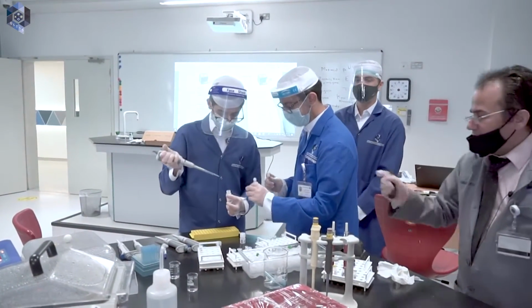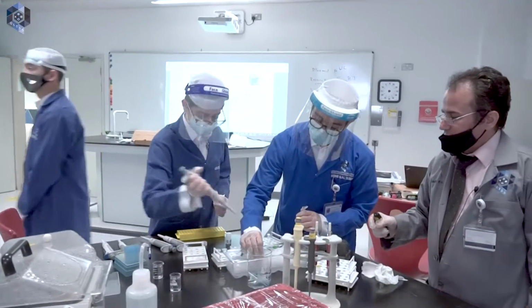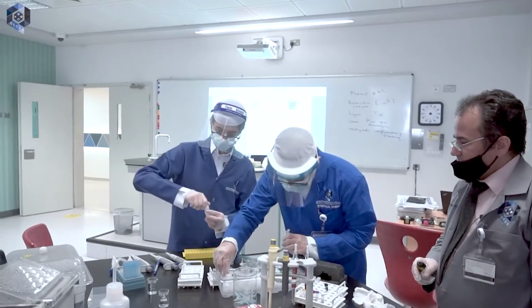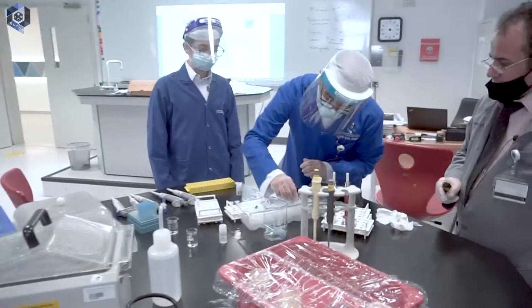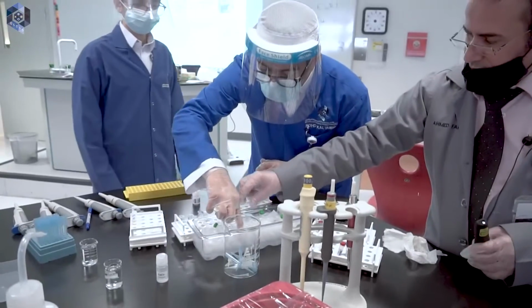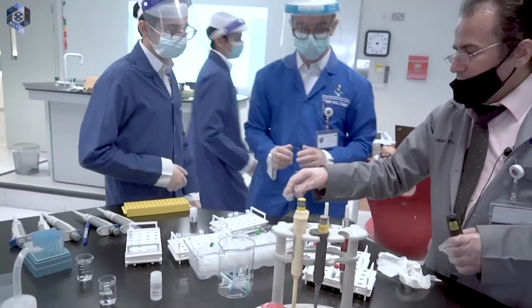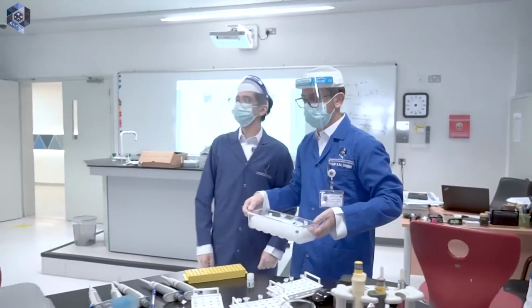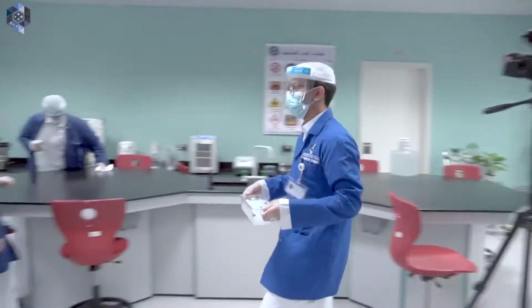No problem, it's calcium chloride, nothing there. Okay. Now, place them on ice. Now, take the ice bucket there to that bench. We'll continue working at that station now.